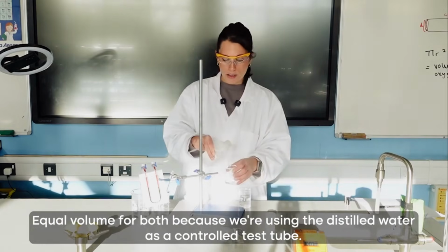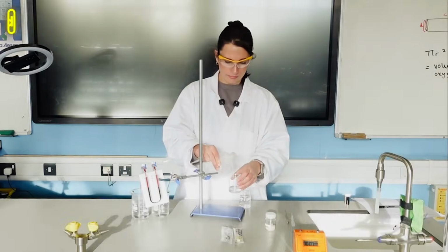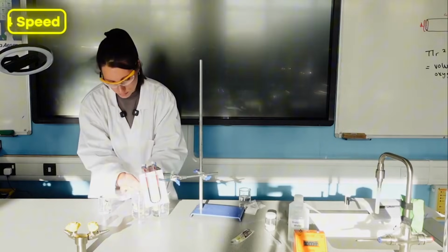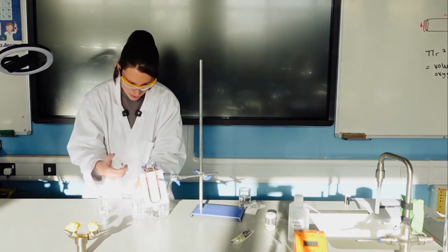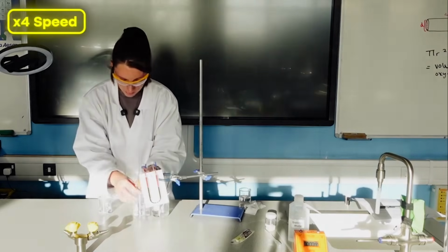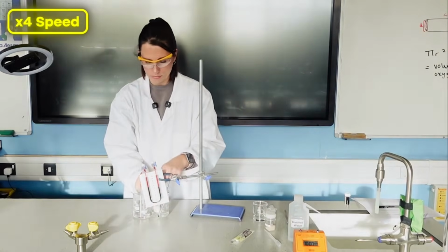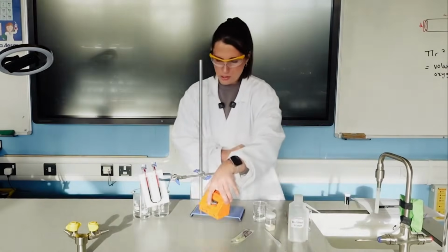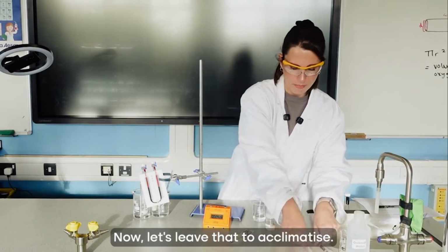Equal volume for both because we're using the distilled water as a controlled test tube. You do have to be very careful because this is all very delicate and fiddly. Okay, and let's leave that to acclimatize.